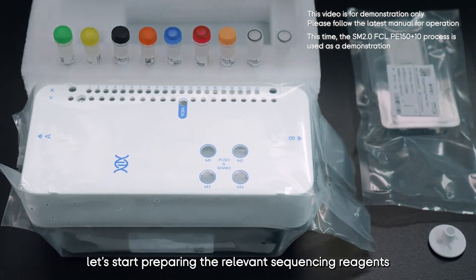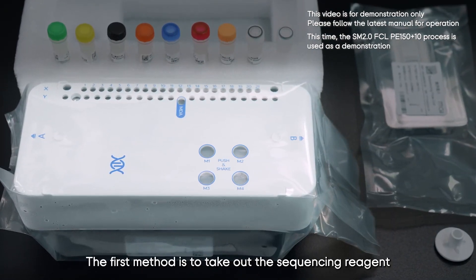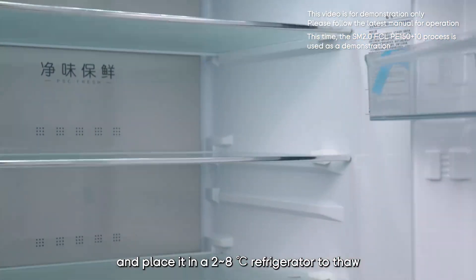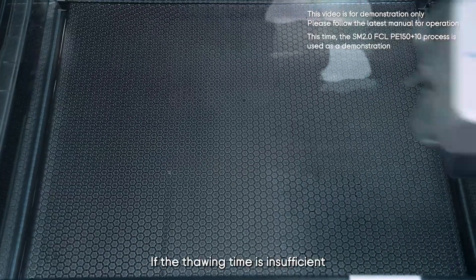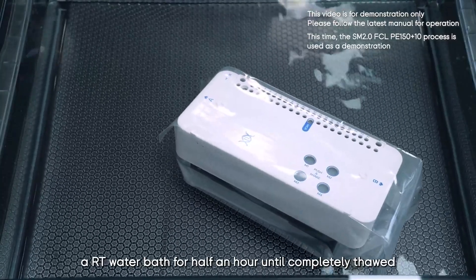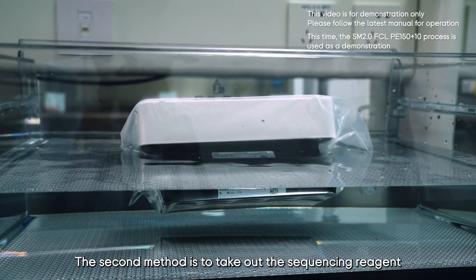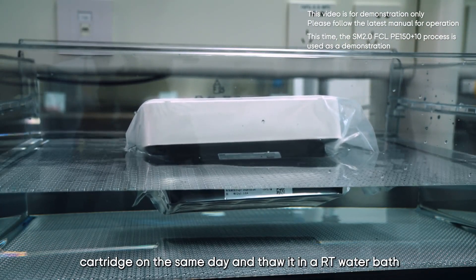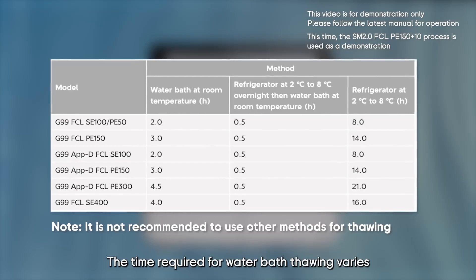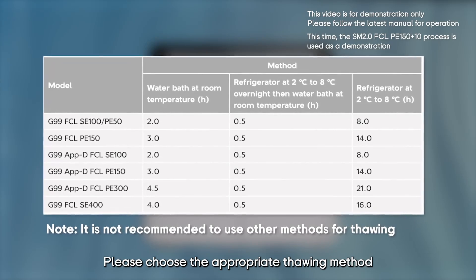Now let's start preparing the sequencing reagents. There are two recommended thawing methods for the sequencing reagent cartridge. The first method is to take out the cartridge one day in advance and place it in a 2–8°C refrigerator to thaw. If thawing time is insufficient, you can perform an RT water bath for half an hour until completely thawed. The second method is to take out the cartridge on the same day and thaw it in an RT water bath — add water to make the cartridge float completely.